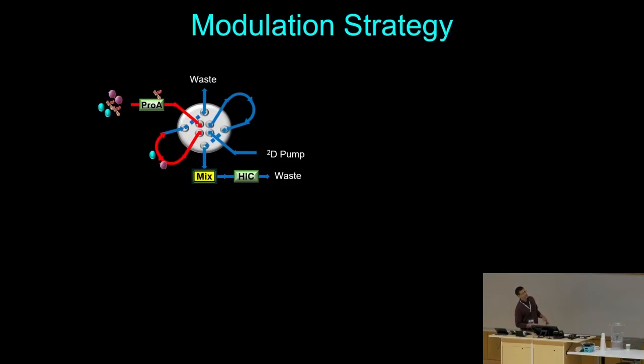Have the 1D effluent in red and the 2D in blue. And there's a piece of blue in the first sample loop for a reason. The idea is we used two 200 microliter sample loops and only partially filled the sample loop to help aid in dilution of the 1D effluent before reaching the second dimension column.